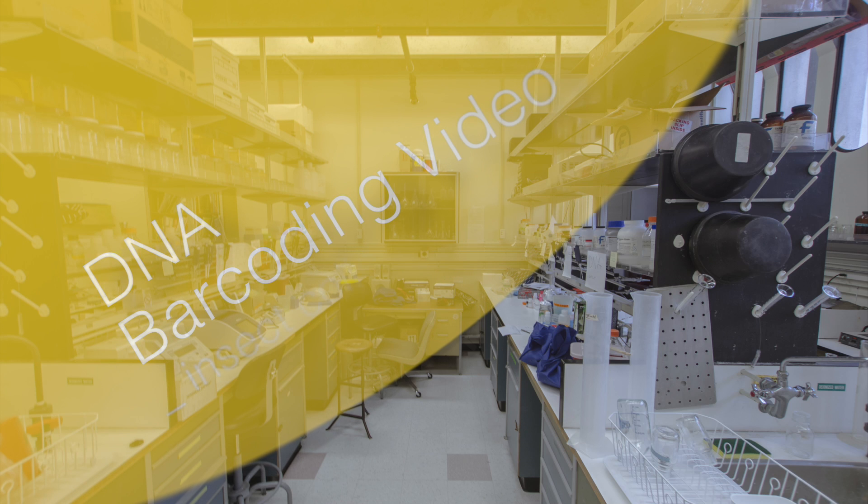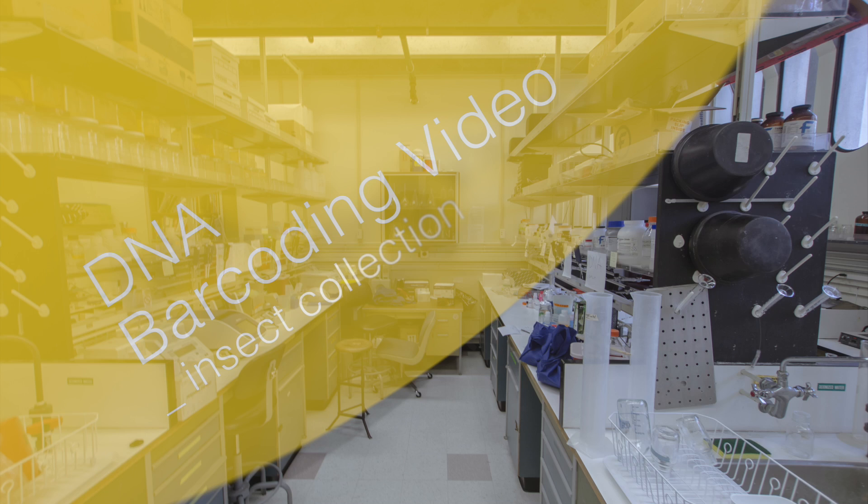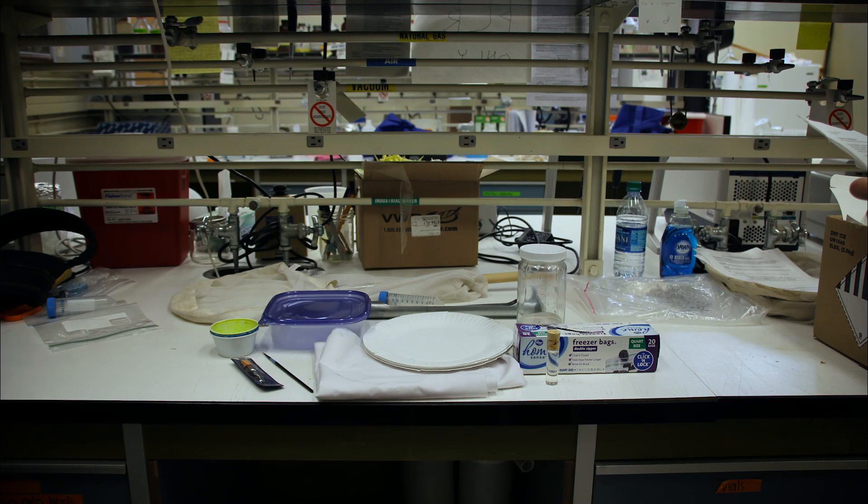Hello, this video will show you the most common equipment that we use to collect insects.